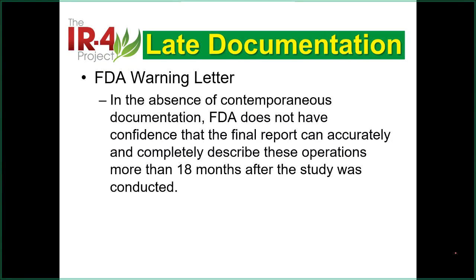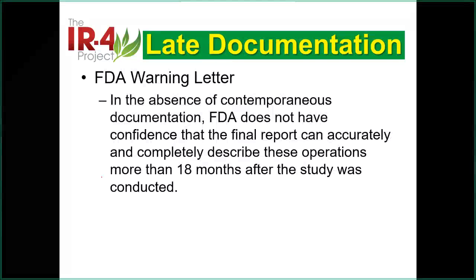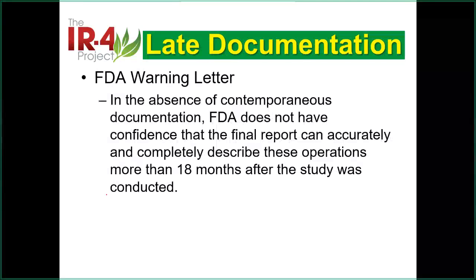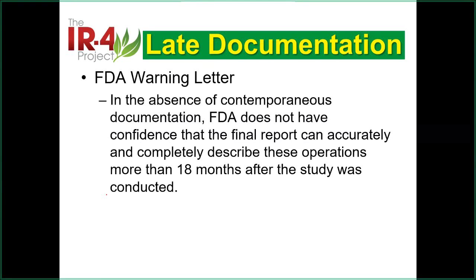This is the wording from the FDA finding. You can find this on the web as well. If there is any key data, you just scribble it like that. Eventually, people cannot see the original data, and that's the biggest finding, because that's some kind of a shady thing there. This is the key number.